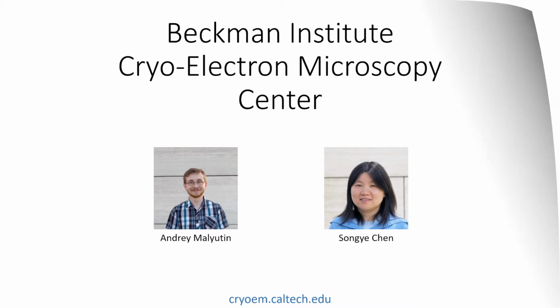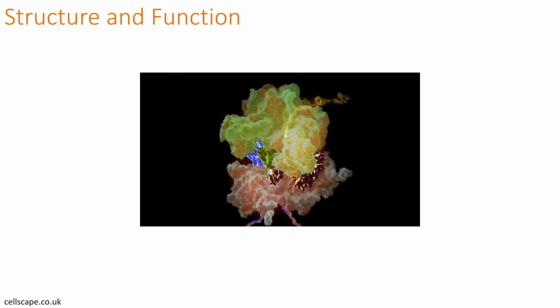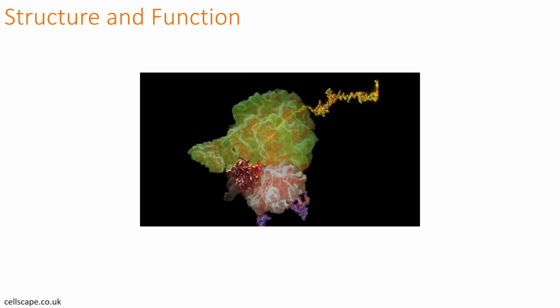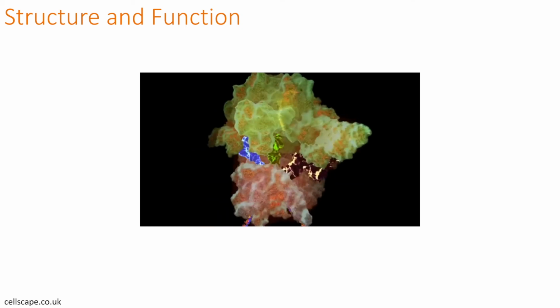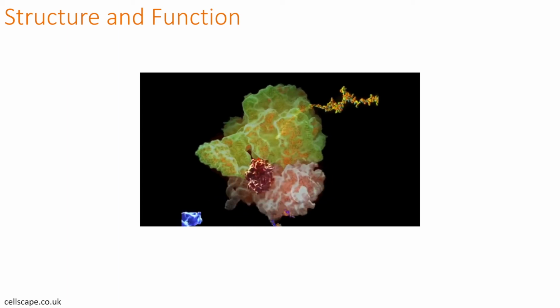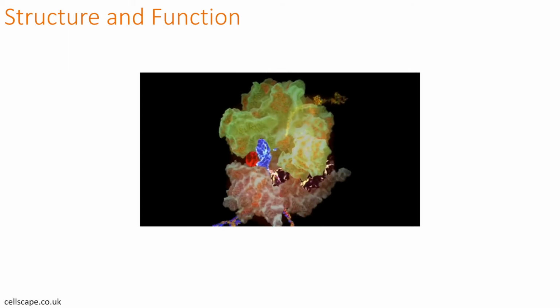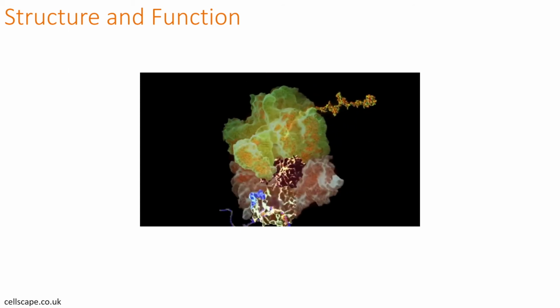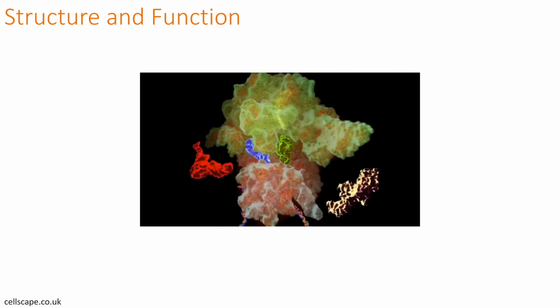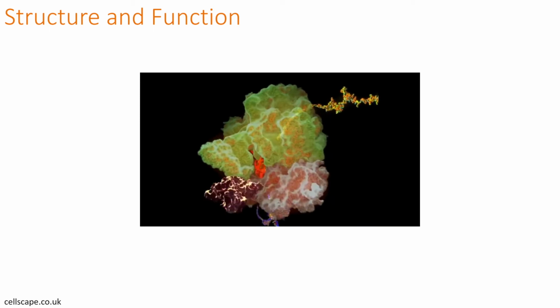Now let's get started. One of the fundamental ideas in biology is that if you have a high-resolution three-dimensional structure of the protein, complex, organelle, or cell, one can understand its function, as well as any associated diseases. With that information, then therapeutic structures can be developed. On this slide, you can see an animation of translation by bacterial ribosome, and this is possible due to availability of high-resolution structures for most of the complexes involved.